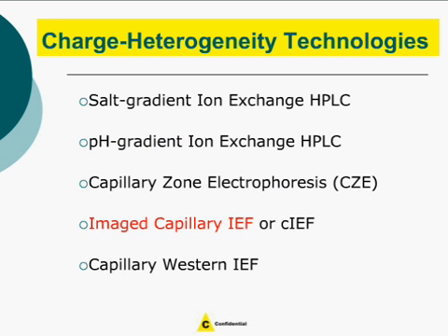But because of its high resolving power, rapid method development times, and quick run times, imaged capillary isoelectric focusing is a very powerful tool. It is suitable for first-line bioanalytical analysis and can be used for a variety of applications in product development.